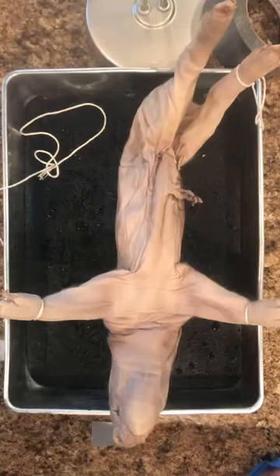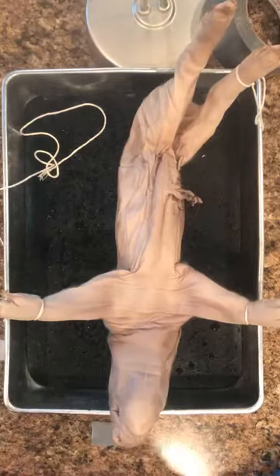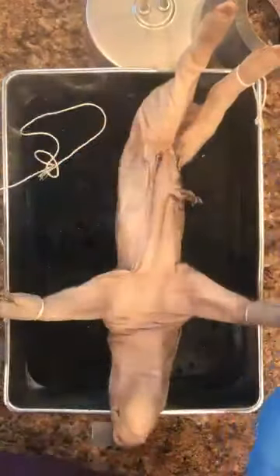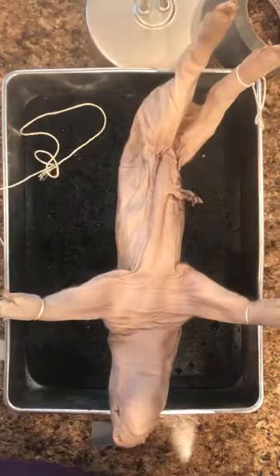Okay. Today we are going to work with the mouth and then expose the digestive system. But before that, because I know you guys don't skip through my videos, this pig is definitely a female. I will show you a picture of the male versus female again.